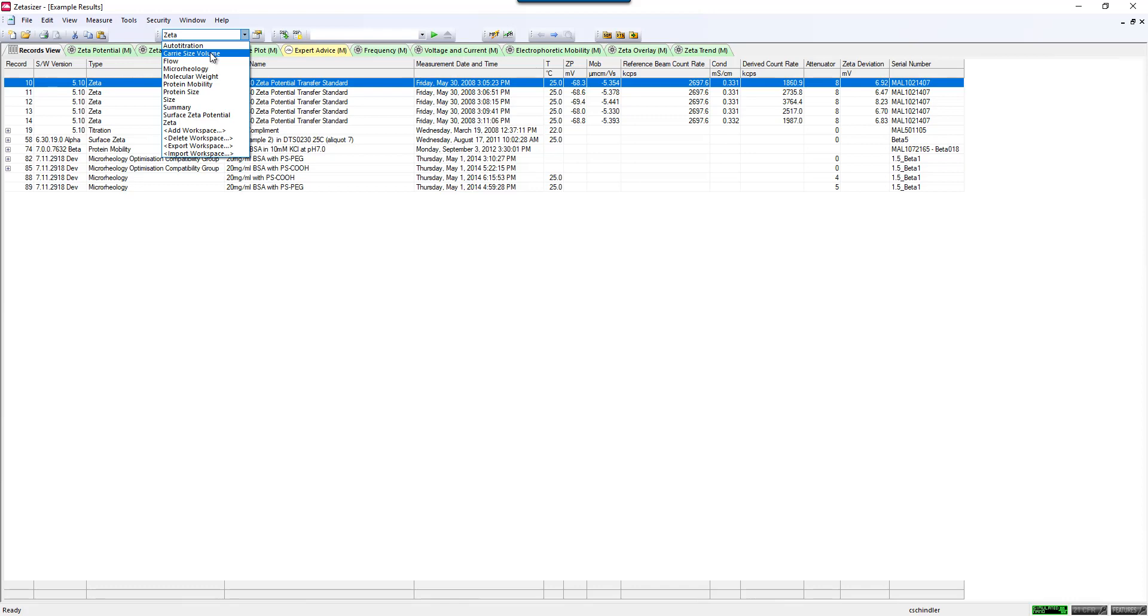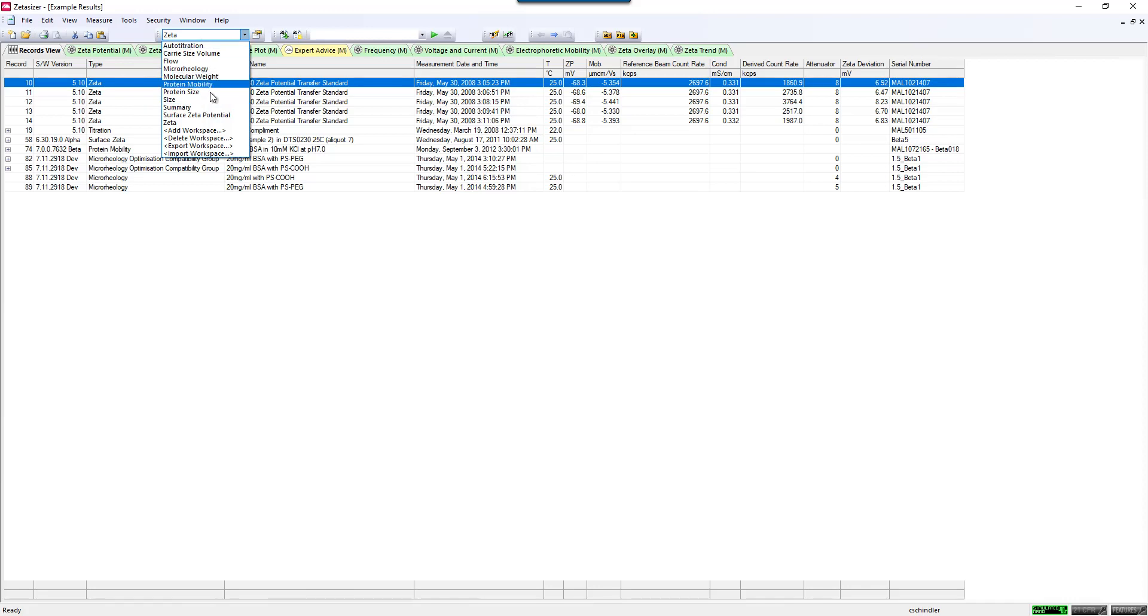What I would caution you is that this is a global change, so if you have a lot of users using your system, what I would probably do is set up and save the default workspaces. But also, if you want people to be able to create their own, they can do it on their own computer with their own software you can download free from our website, or they can display them on your computer just saved with their new name.